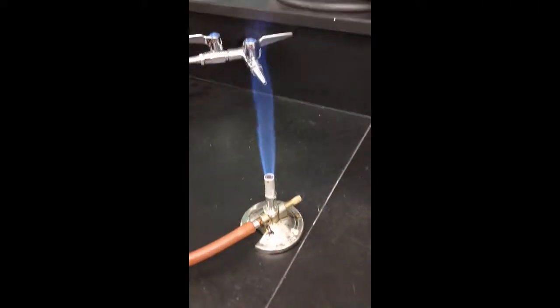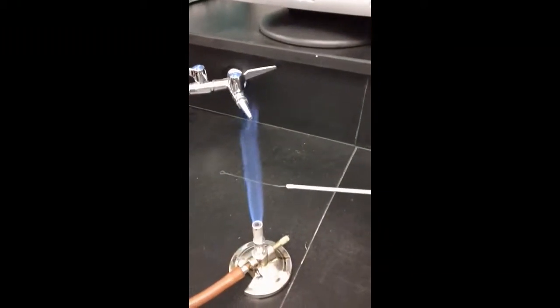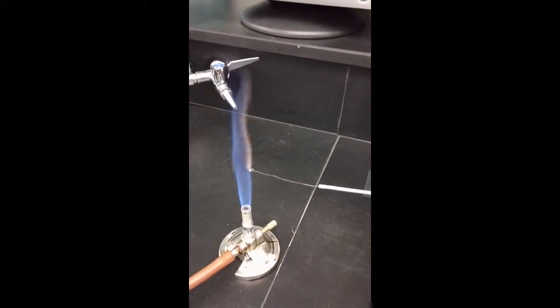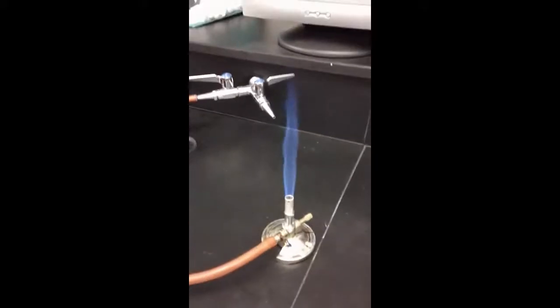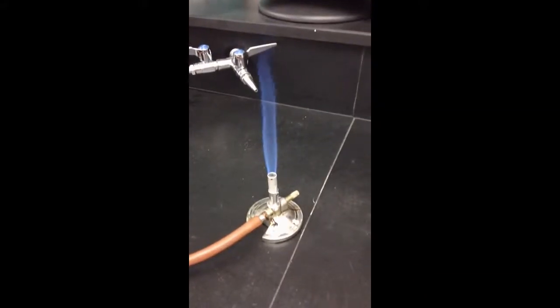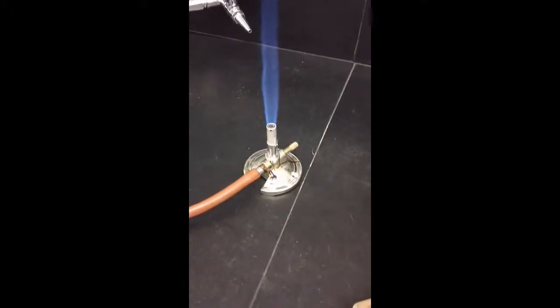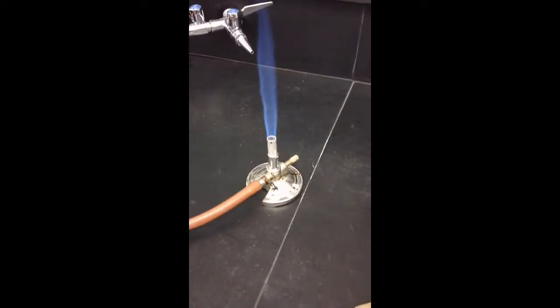Okay, so there I have it lit. Now I need to make sure that my flame test rod is clean. I'm going to put it there and make sure it doesn't burn any colors. Alright, so now is when you're going to want to make very sure that you're taking detailed observations. This is under test 1, test A, and I am going to start with CR. CR is what you're writing your observations for.